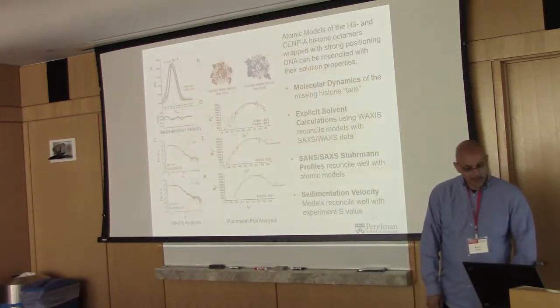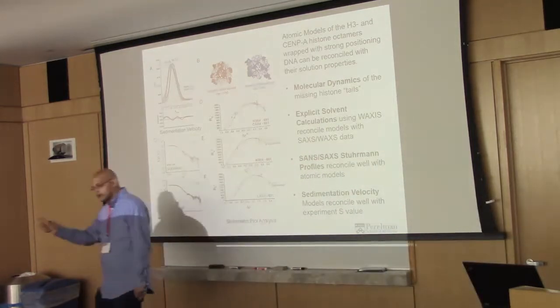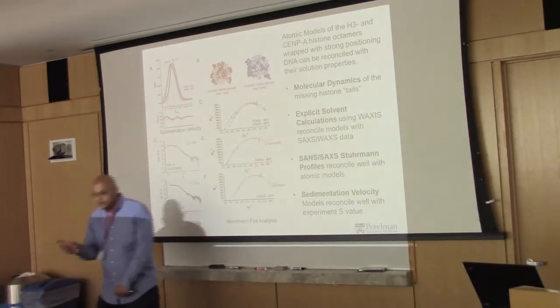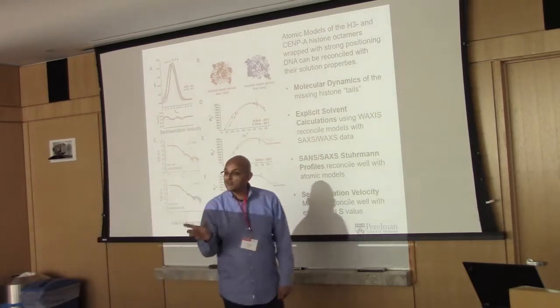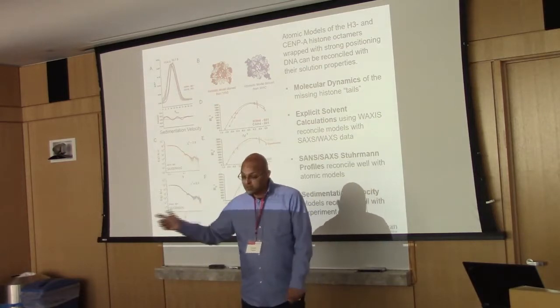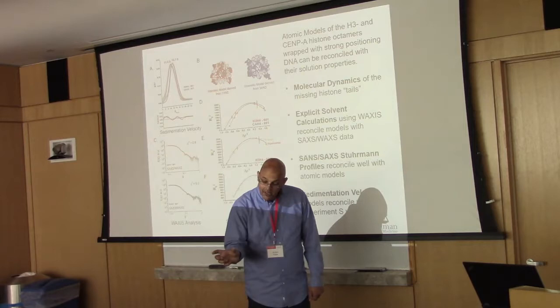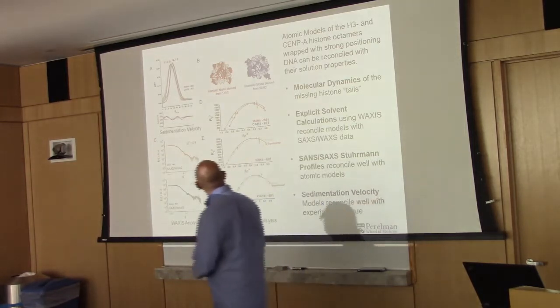The first question we want to ask is, can we take the crystal structure of a nucleosome, build in the missing parts, and then reconcile it with the solution data? The most basic of experiments. Can we take a canonical nucleosome and reconcile it with solution scattering and its biophysical properties? The short answer is, we think so.